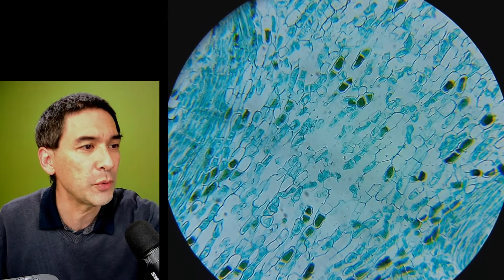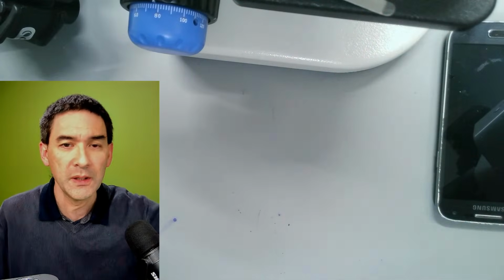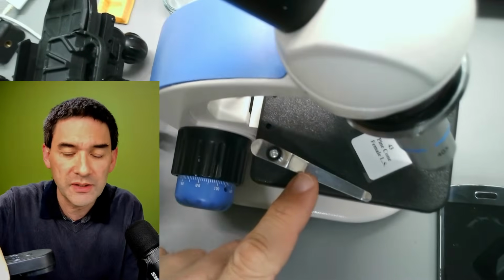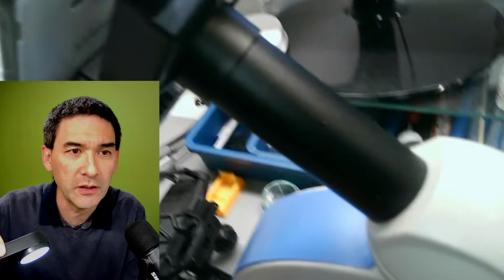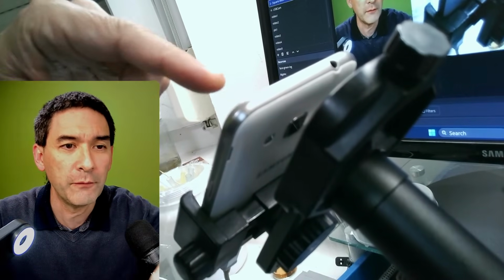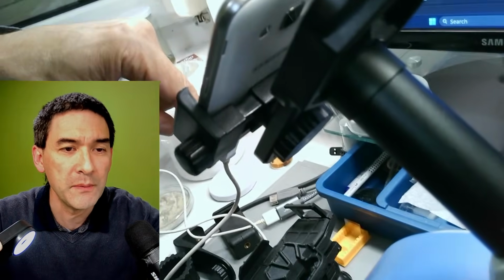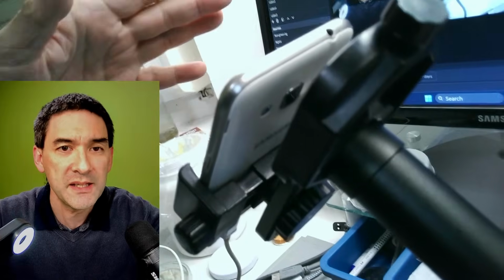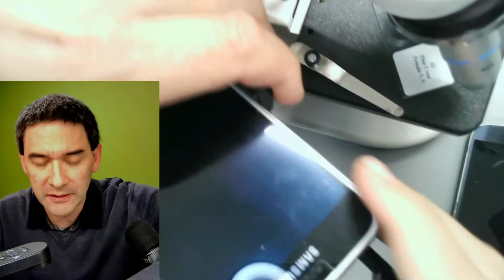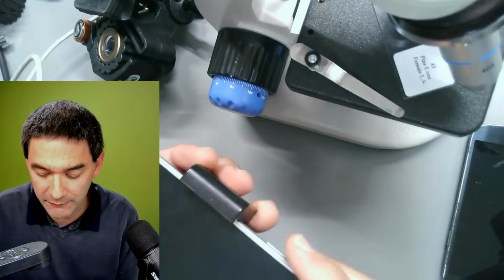So what I'm going to do is switch over to the desk view, and quickly show you, as far as I can, the microscope that I'm using. So it's an introductory microscope, and over here I've connected a pretty old mobile phone camera over USB, and that's basically the image that you've been just looking at. I also want to show you some of the advantages and disadvantages of the different camera systems that I have.